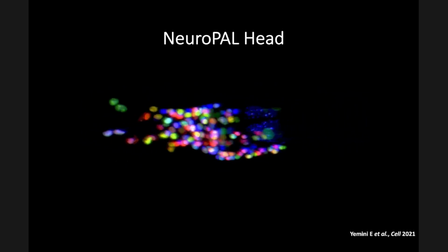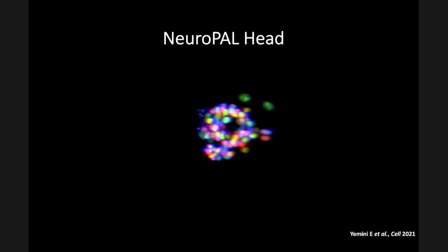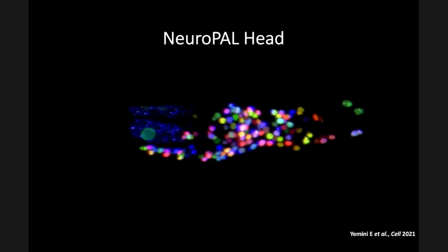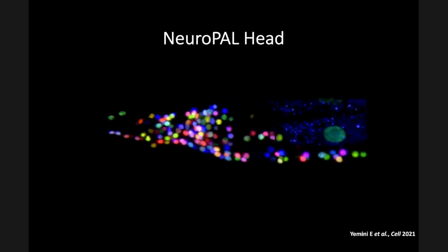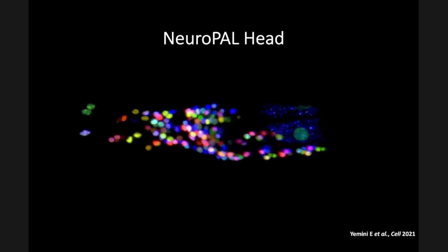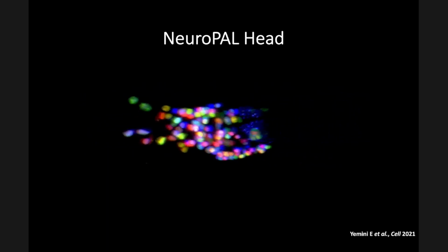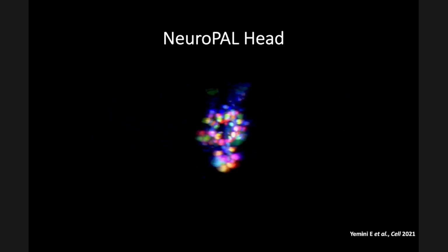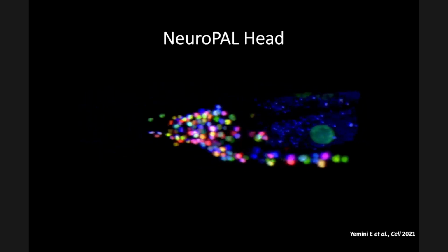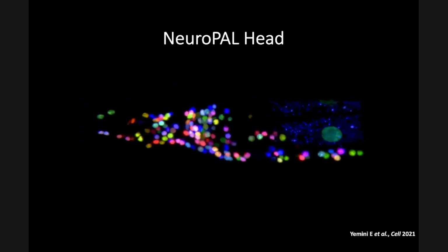And even at the level of when you get really good resolution from the confocal, the nuclei look different. And that's probably a result of some of the chromatin. So not all the colors are just expressed in the nucleus, like by driving nuclear expression. Some are attached to histones because otherwise they aggregate. It's an unfortunate thing with some of the colors, basically, that the groups that worked on them did a fantastic job in trying to make them monomeric, but ultimately that meant trying to erase some binding sites that made them either tetramers or dimers, and they still have a little bit of affinity for each other.